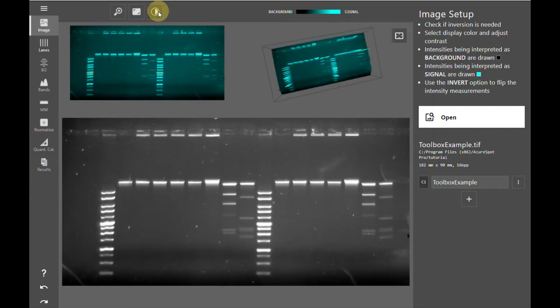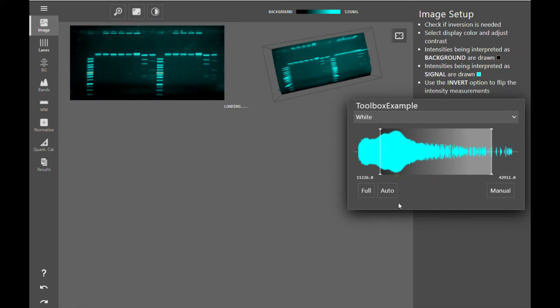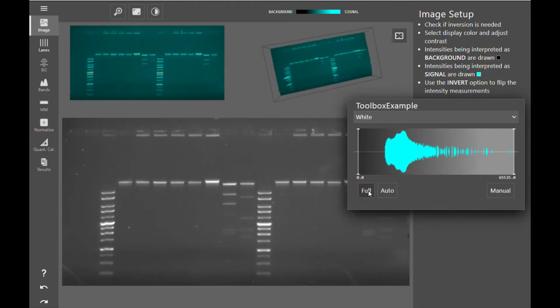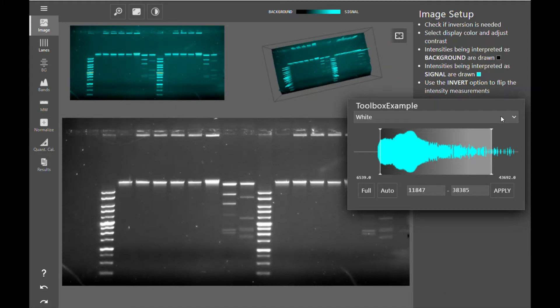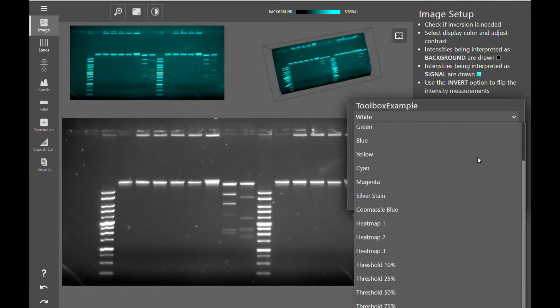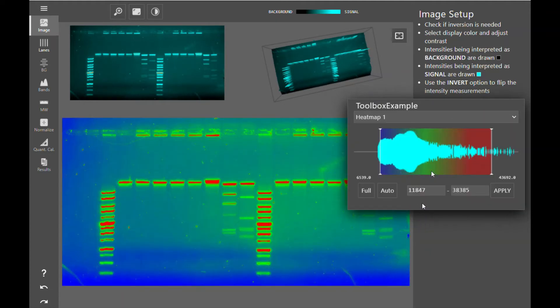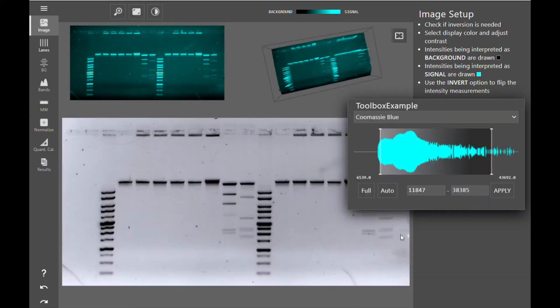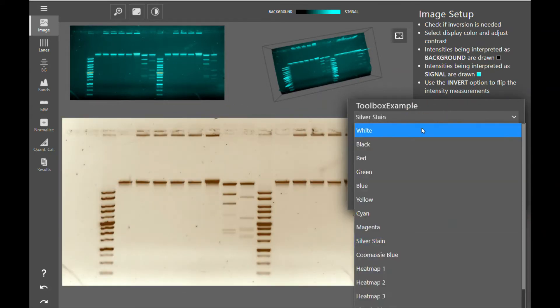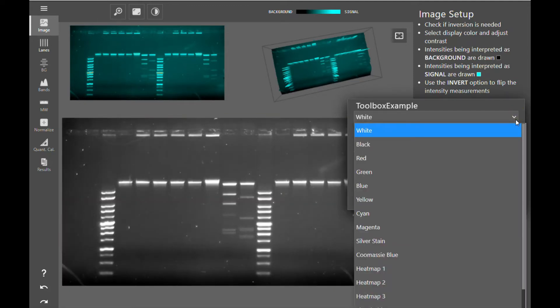To adjust the display and contrast of your image, click the contrast button and use the sliders to adjust the contrast of your image. You can view the full data range of your image by clicking full or auto-contrast it by clicking auto. You can also select manual for more fine-tuned control of the contrast. From this menu, you can also select pseudo-coloring of your image. There are several pseudo-colors to choose from, including several heat mapping options and presets for Coomassie stains and silver stain. All these color options are pseudo-colors only, so changing the color does not affect your data, only the way your data is displayed.